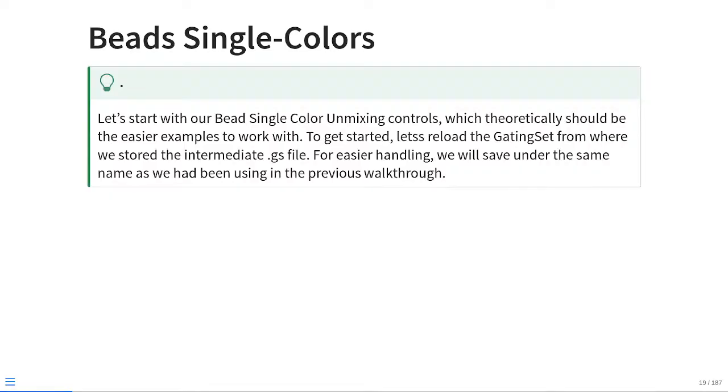So let's go ahead and start first with the bead single color unmixing controls, because theoretically these should be the easier examples to work with, because there's going to be substantially less autofluorescence to handle.